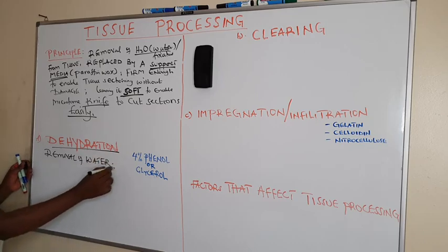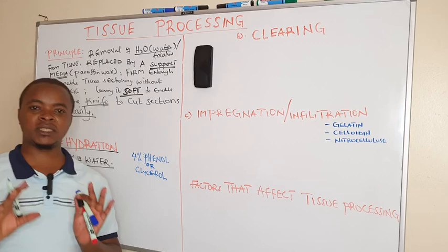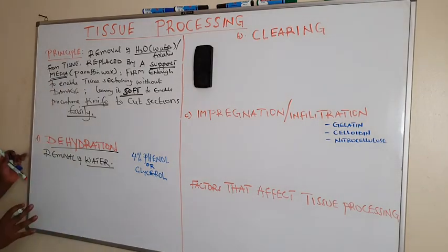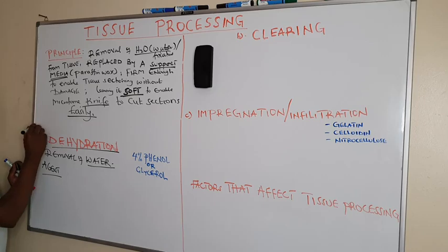Dehydrate means removing water from this tissue. And after removing the water, how do we remove it? We use dehydrating agents.